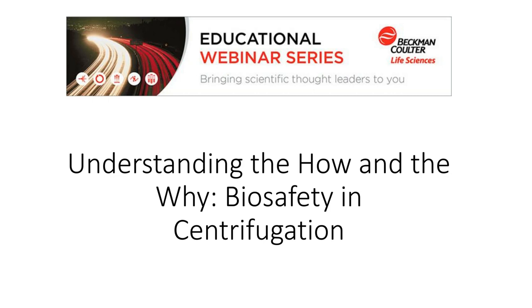You can't derate a rotor, for example, if you haven't kept a logbook, because you won't know how much you've used that rotor. Yes, I'm a huge believer in logbooks. And if you're going to use a logbook, everybody has to use the logbook. You can't go, well, this is only a 5-minute spin. So yeah, I'm a fan.